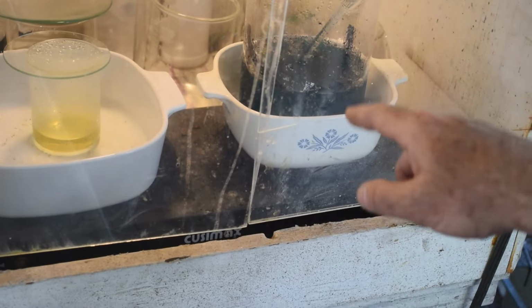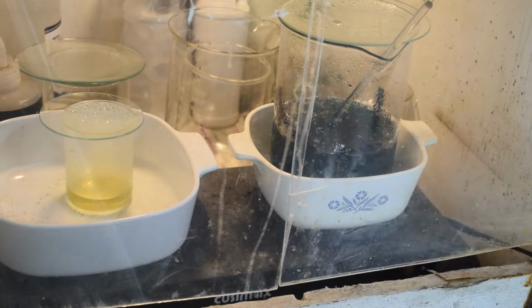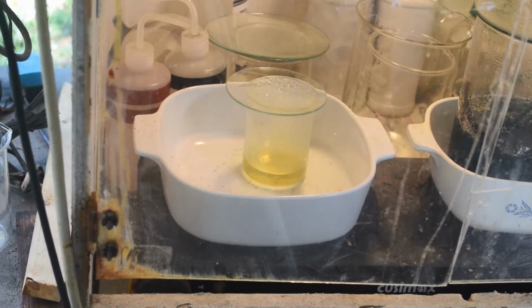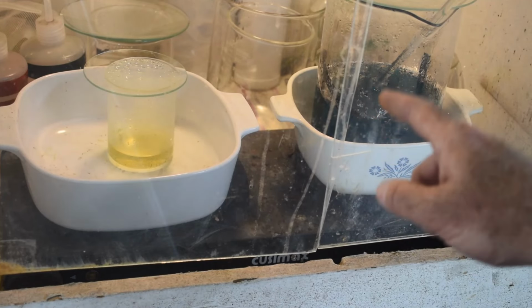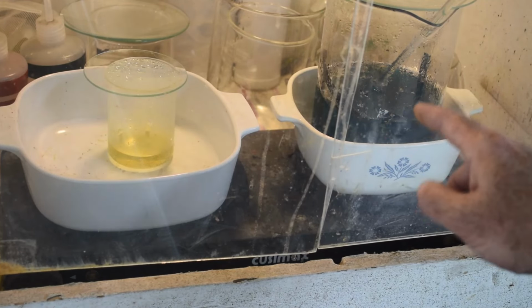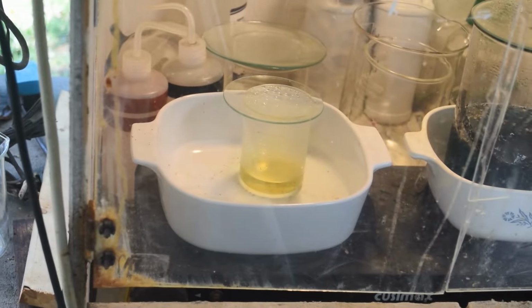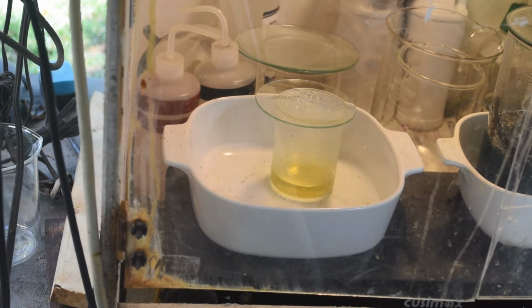I'm not sure that I can do a reliable stannous chloride test on this stuff since the liquid is so intensely colored. But this stuff, yeah, I'm pretty sure I can figure out whether the floating gungeon here is palladium. Well, I had a thought. It might be platinum. Although, I don't know. I'm thinking most of the platinum wouldn't dissolve in nitric acid, but platinum is a very funny metal. It does weird things, so it's possible. We'll do a stannous chloride test on it and find out for sure. Enough speculation. Let's find out.